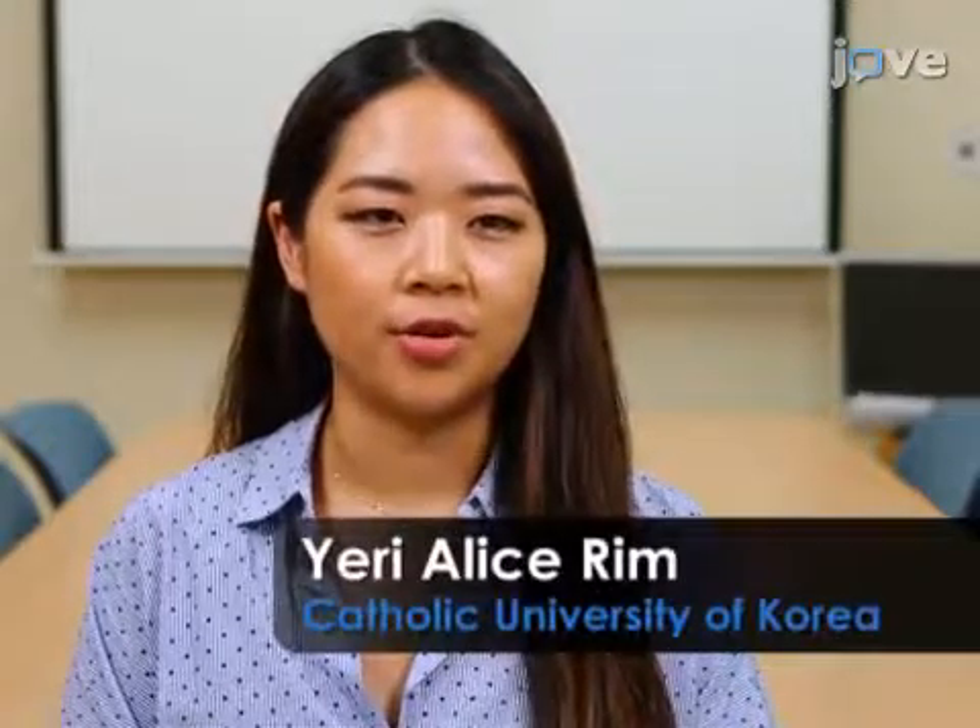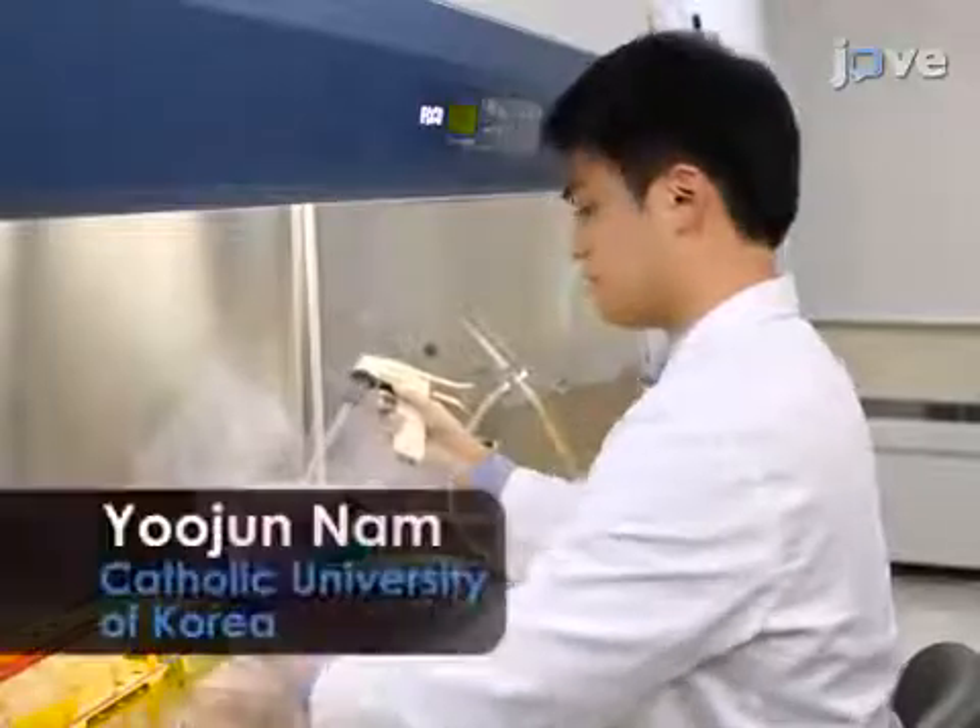Through this study, we will be sharing a protocol about the reprogramming of iPSCs using PBMCs by adding centrifugal force. This protocol will provide another option when reprogramming floating cells. Demonstrating the procedure will be Yuzun Nam, a grad student from my laboratory.